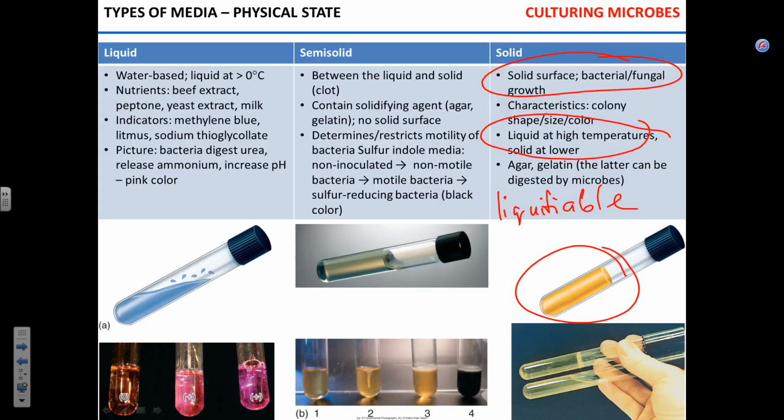The idea here is that if you take agar and you warm it up to about 55, 60, it's going to melt. What usually is done, all the components are mixed together, thrown in a flask, water is poured over it, and placed in the autoclave. Autoclave is right behind that wall, right there. You run the program, it heats it up to 120 degrees Celsius, which is something like 250 Fahrenheit. And the whole thing melts. So when you pull it out, you have a transparent orange-brown liquid.